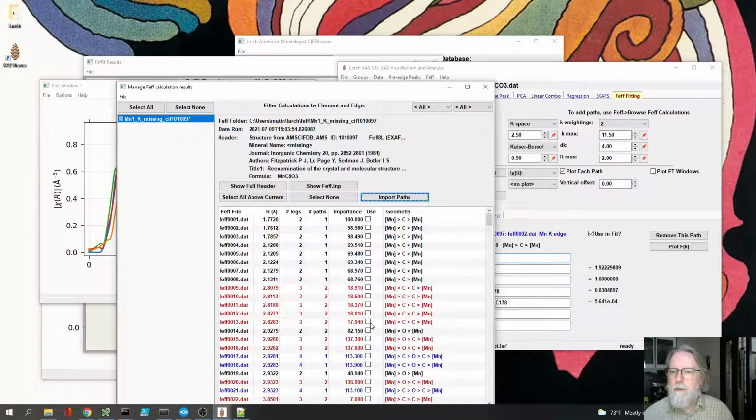Not quite a maximum of 100, because if we continue down, we see that there's a manganese oxygen at 2.93 angstroms. We're going to want that. That's the further oxygen. And then there's one more at 2.932. So there's 2 in one of those. So there's 3 of those oxygens. But then we have these manganese oxygen carbon and manganese carbon oxygen carbon manganese scattering paths that have amplitudes that are higher even than the first path. So those are important to include.